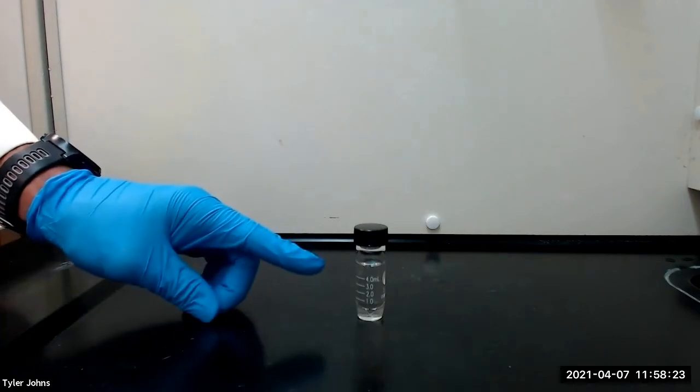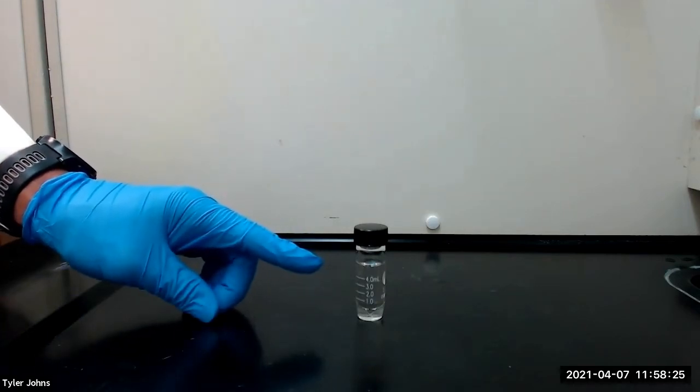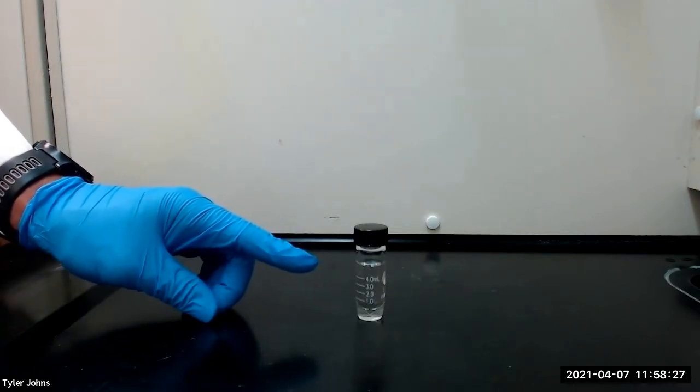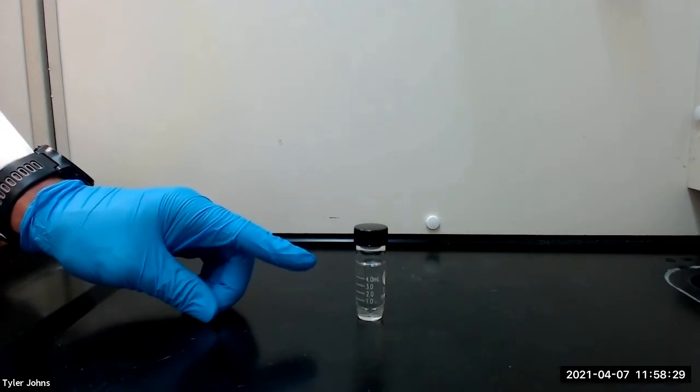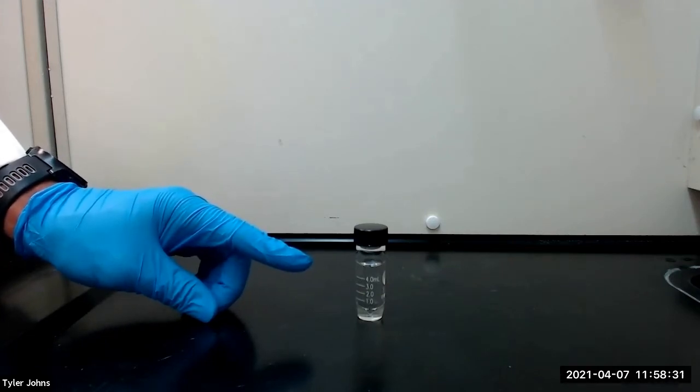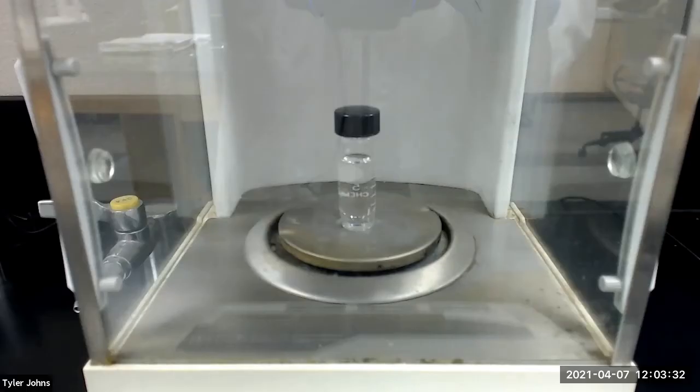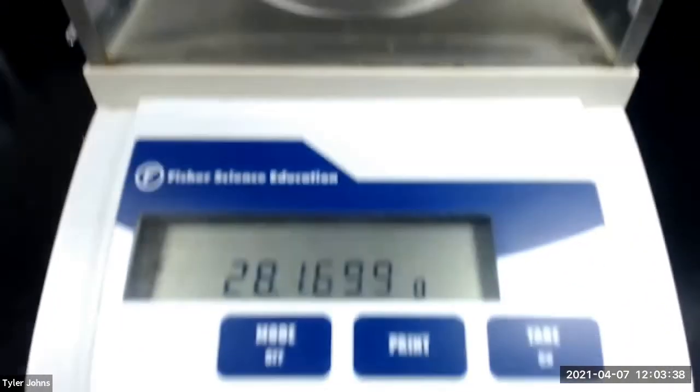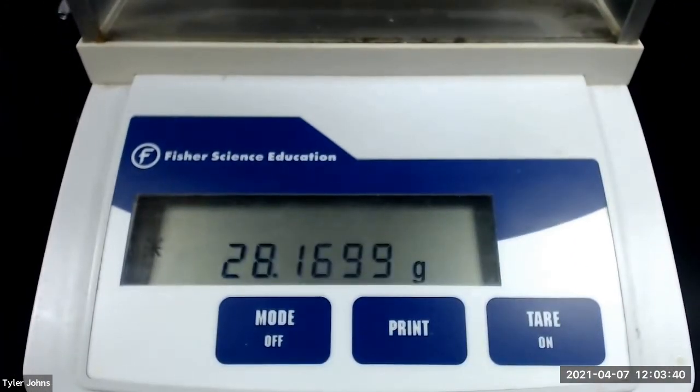After collecting the ester distillate in the pre-weighed 5 milliliter conical vial, we next need to determine the mass of the conical vial plus the purified ester. The mass of the pre-weighed 5 milliliter conical vial plus the purified ester product is 28.1699 grams.